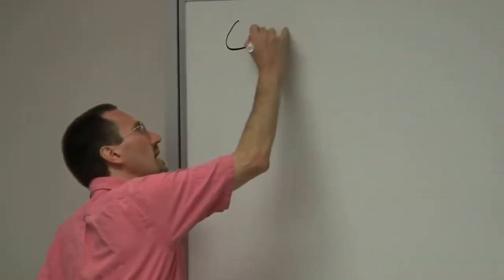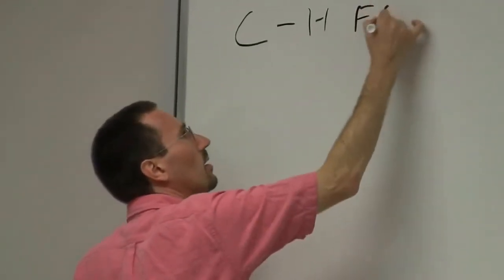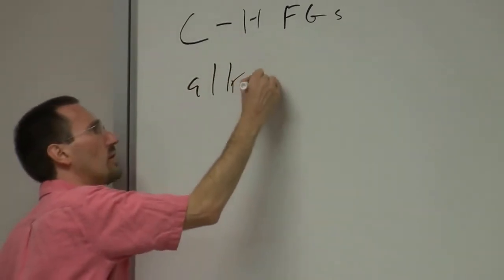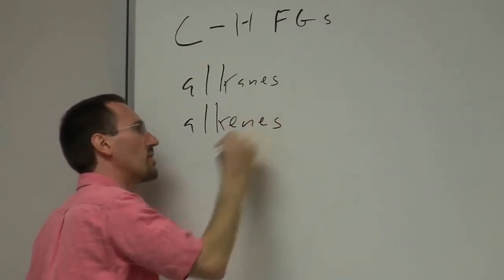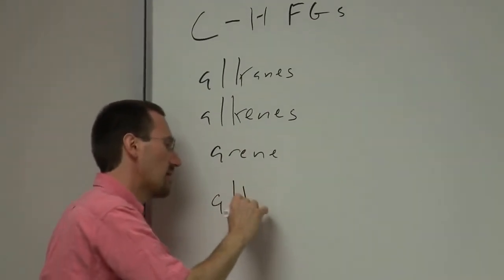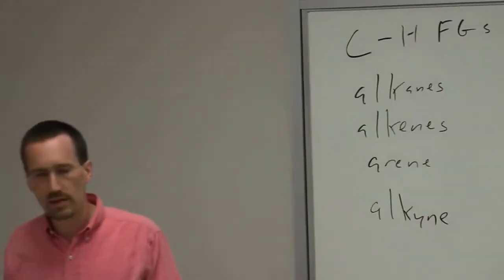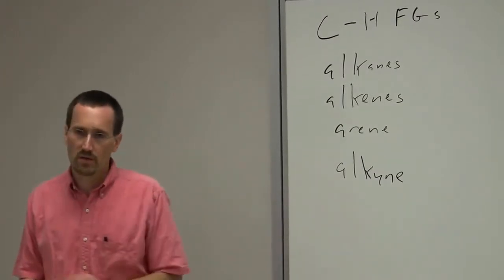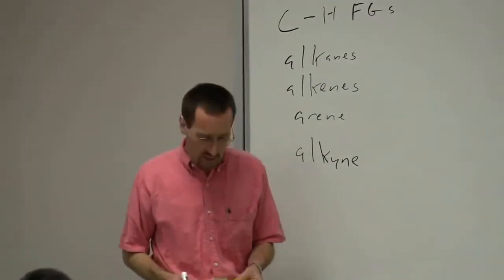So today I want to talk about CH-containing functional groups. In other words, I want us to be able to know how to identify alkane groups and alkene groups or fragments within molecules. Arene, in other words, aromatic, alkyne. And one of the pieces of philosophy that I'm going to try to take, particularly as we get to certain functional groups, is to start to look for patterns here. Because it's not so much about tabulating peaks, it's really about being able to read spectra.